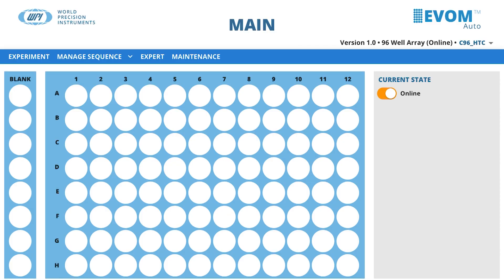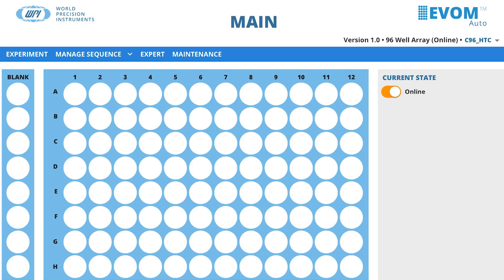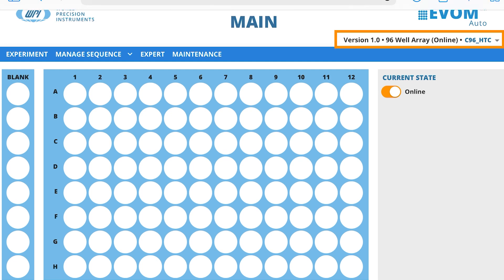To select the desired brand, click on the brand name under the EVOM Auto logo in the upper right corner of the main window. The online status is displayed next to the electrode array type in the header.